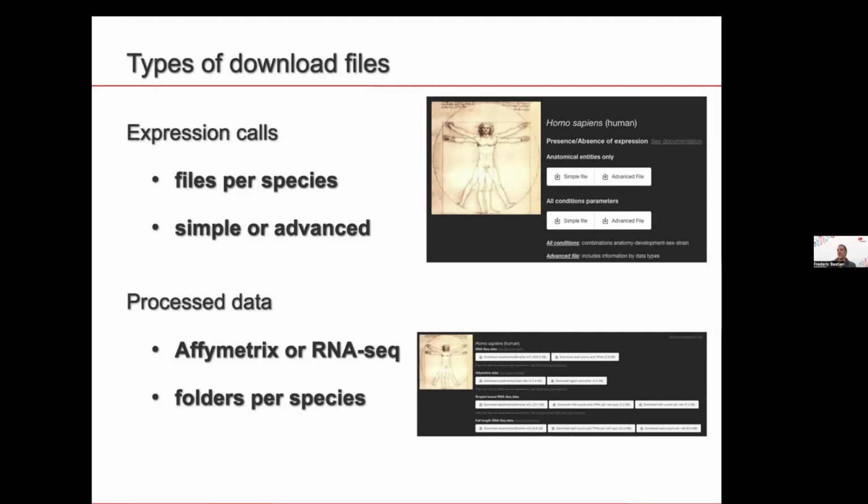You don't have to redo the read mapping, you don't have to retrieve the raw files from SRA, you don't have to figure out which files were wild type healthy, what the conditions were. We provide everything.